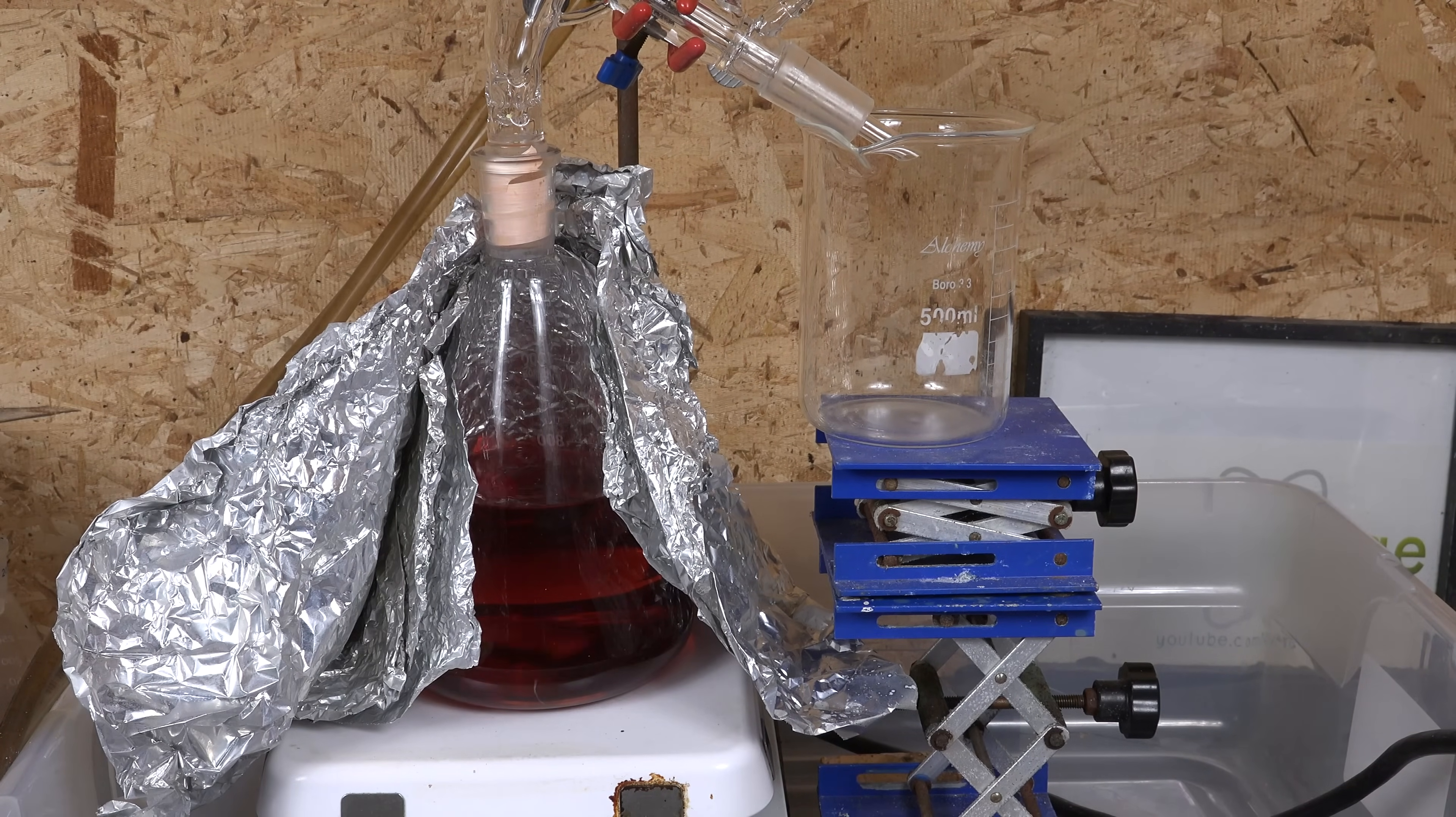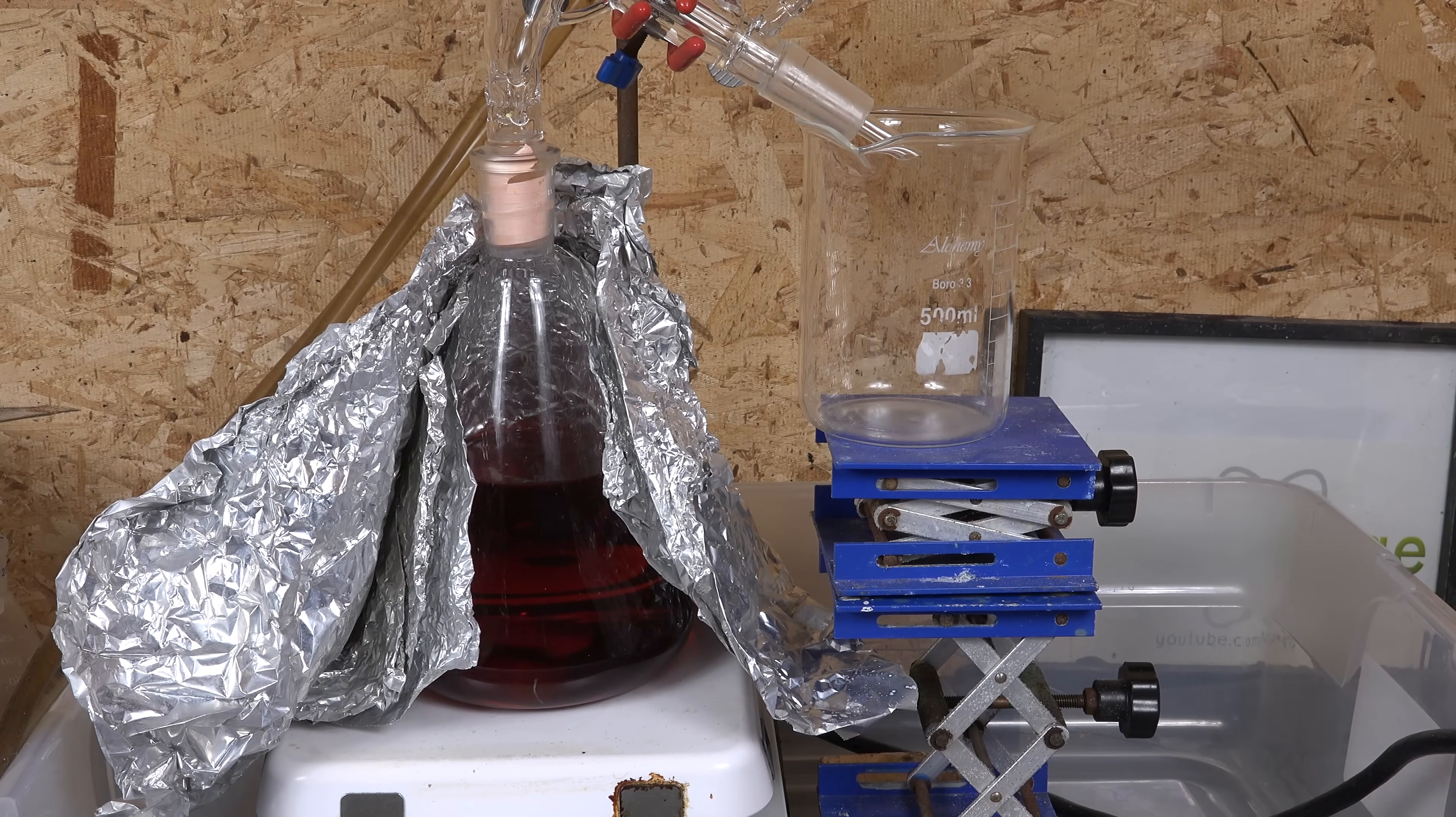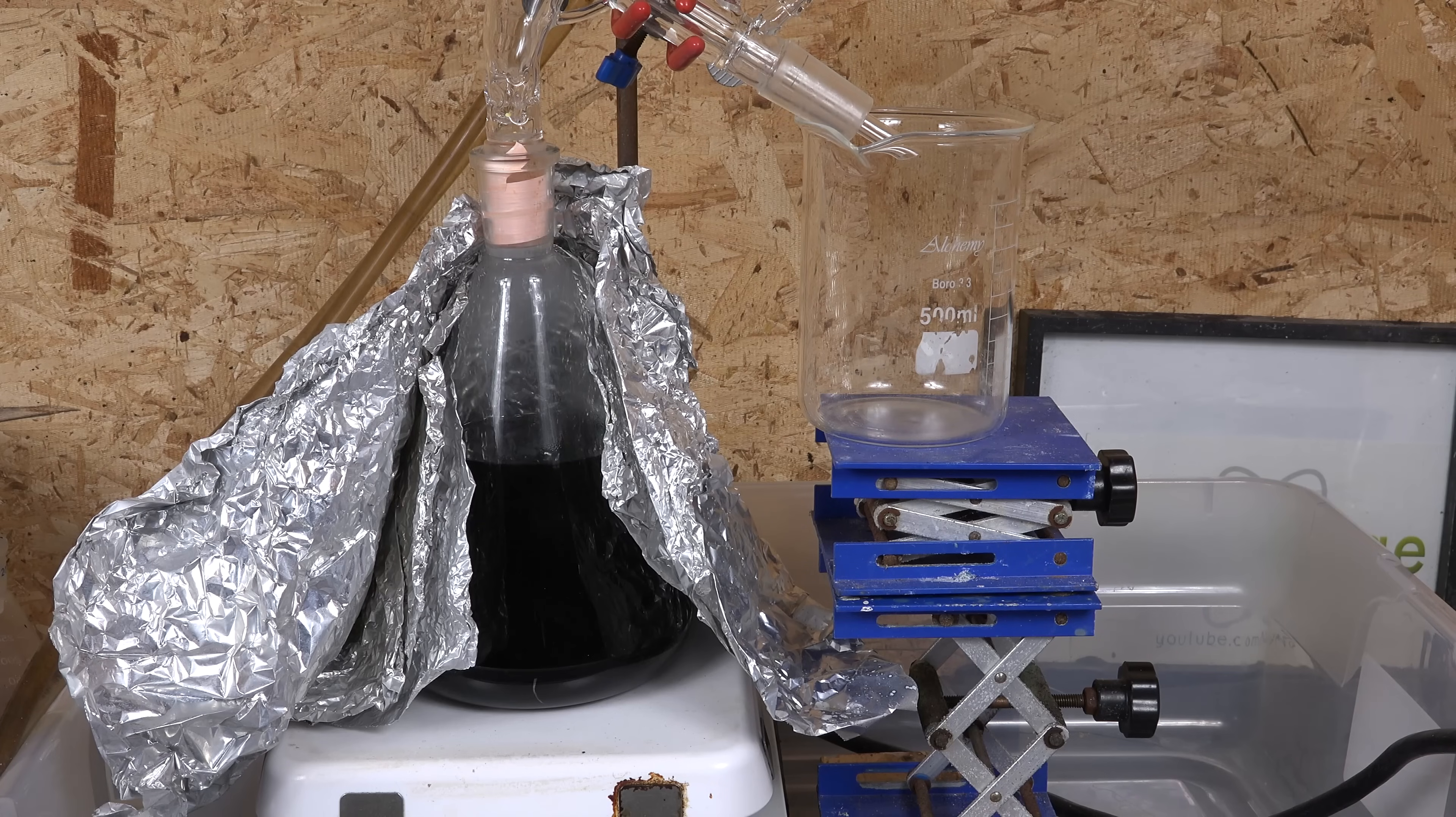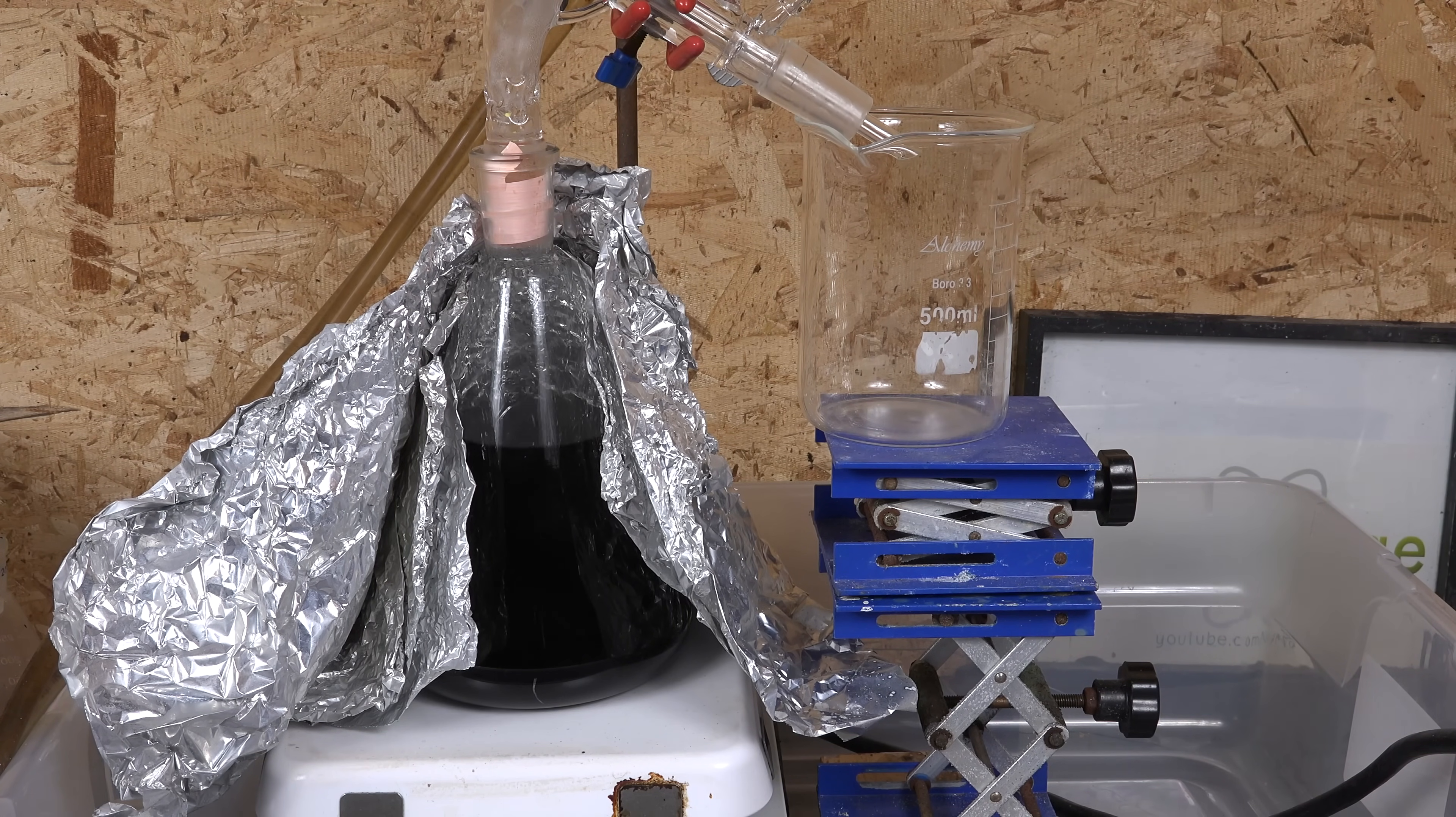At first the sulfuric acid expands and darkens as the impurities char and decompose. Drain cleaner grade acid tends to be the waste product of industrial processes, which is why it has these impurities. Depending on the source it can still be very good acid so for reactions like making nitric acid, it's easier to just use the drain cleaner acid directly and distilling it is unnecessary. But for sensitive work like analytical chemistry or electroplating, pure acid is desired.